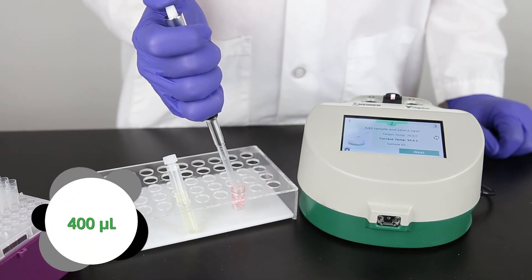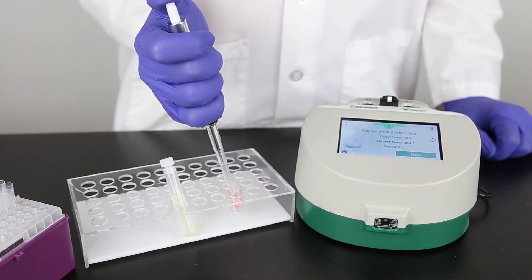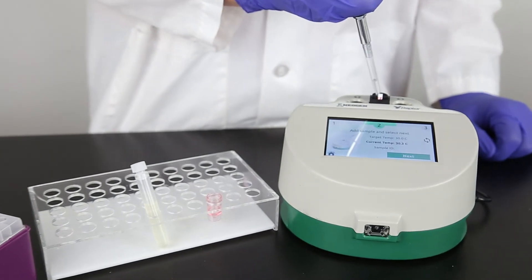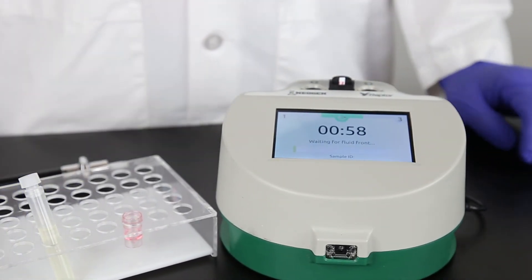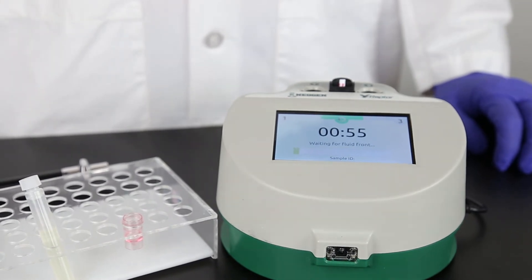Pipette 400 microliters of sample into the Raptor cartridge. The system and timer will start as soon as it detects the fluid front on the sample strip. You can now start samples in the other two ports on the Raptor. Each port operates independently.